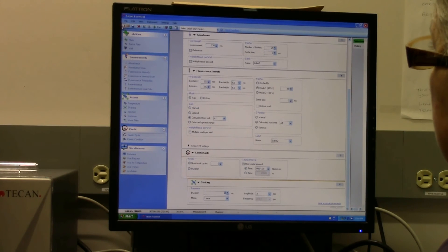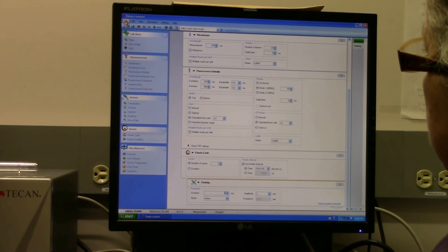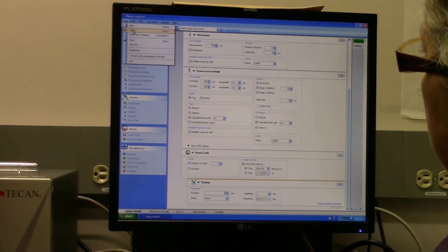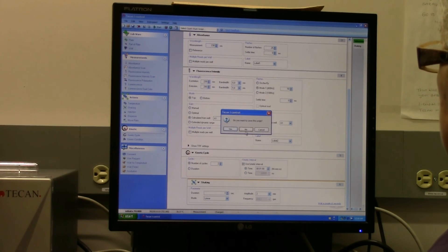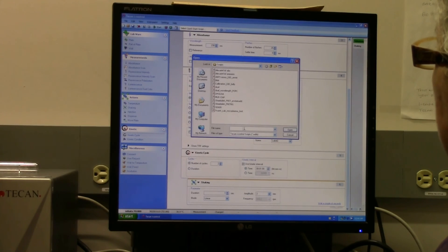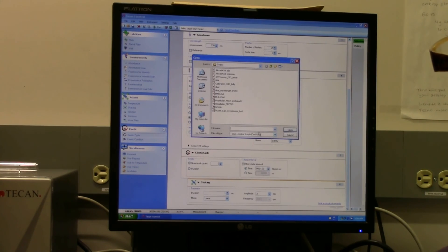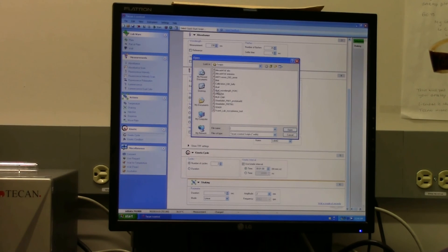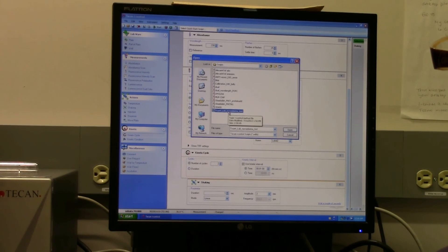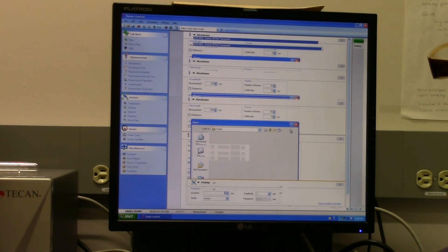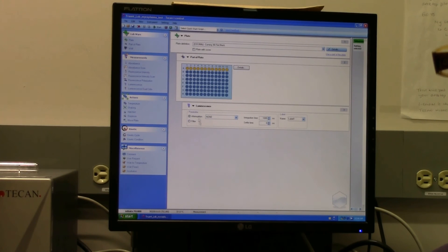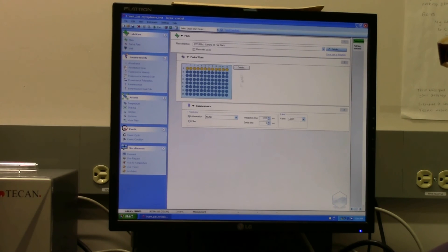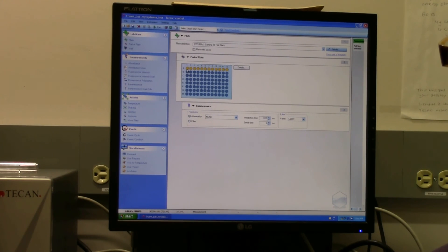And then when you come back again to make another read, you would just go to File, Open, and then this folder will open, and you just choose the file that you want or that you've saved previously. And it will open it, and everything that you had put in there will be there, along with the part of the plate that you're reading, but you can change that.